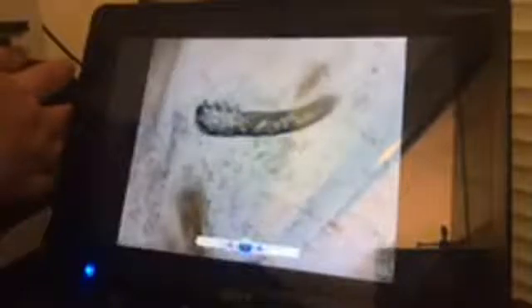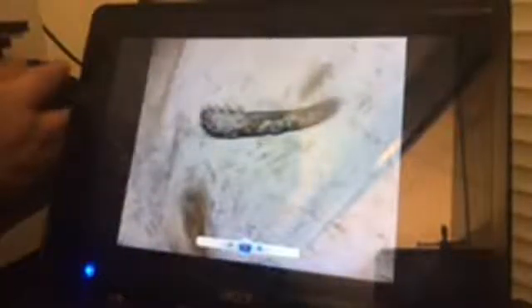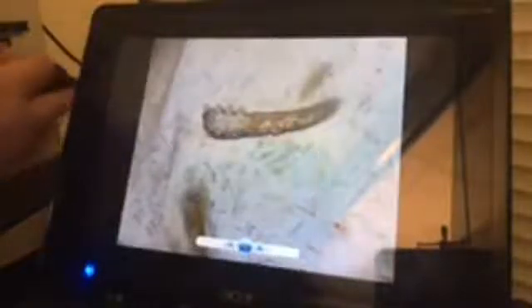See, the body is opaque. She just doesn't want to do it for me. So basically the body is full of consumed oil, feces and eggs. I'll have a look for more in the sample in a second and see if we can find any males, but generally the males are truly semi-transparent, so you can essentially just see the outline.